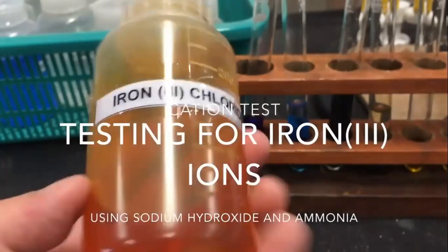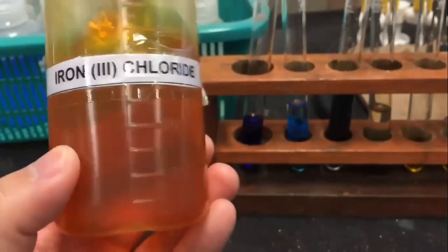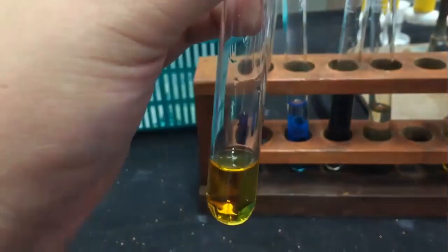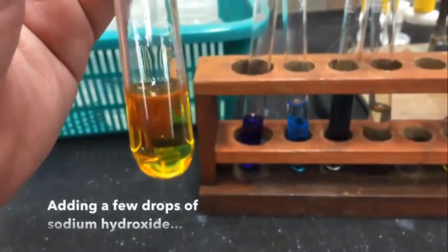Solutions containing iron 3 ions are typically red-brown, orange, or yellow in color depending on the concentration of iron 3 ions. To test for the presence of iron 3 ions, we may employ the sodium hydroxide test. To a small sample of your solution, add a few drops of sodium hydroxide.